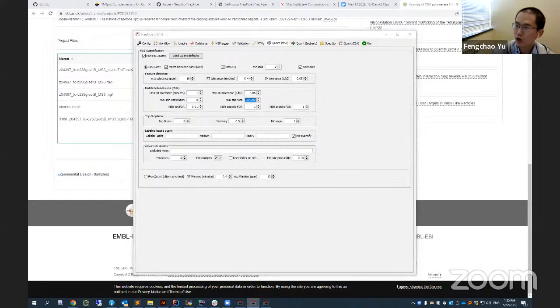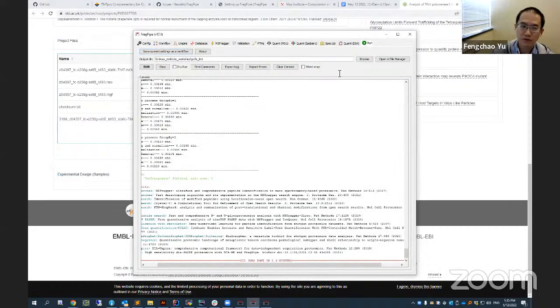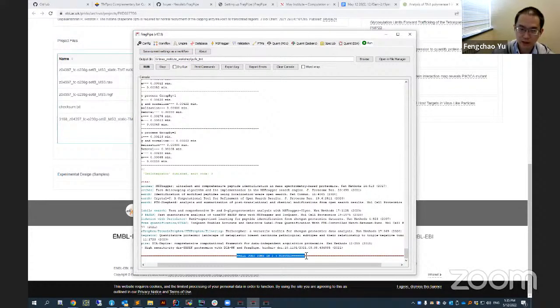There's a quick question. How do you tell if the run is done? You will know it is done because it says all jobs done in 3 minutes, in 2 minutes.